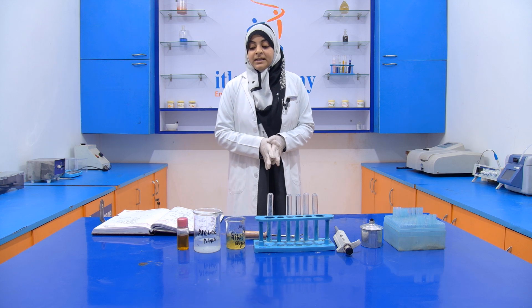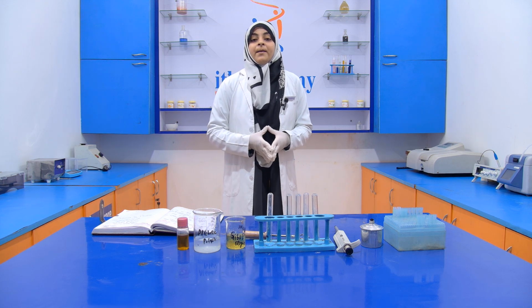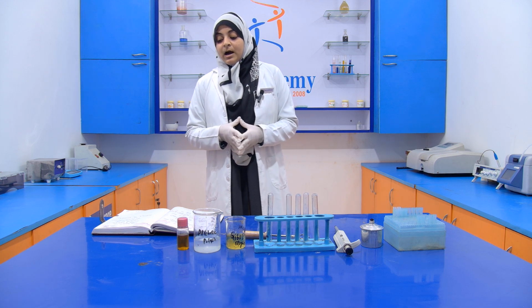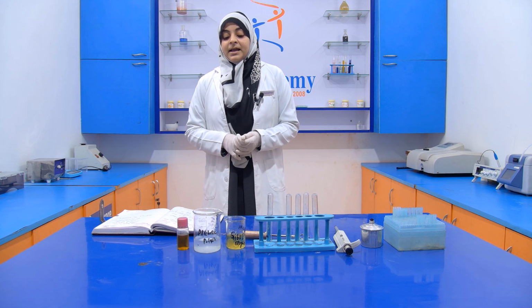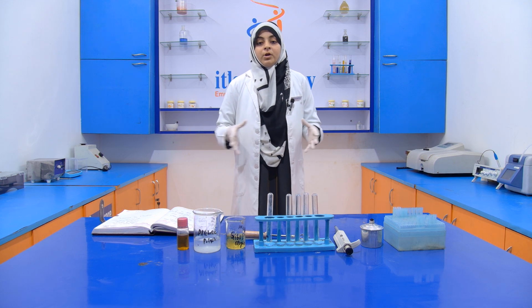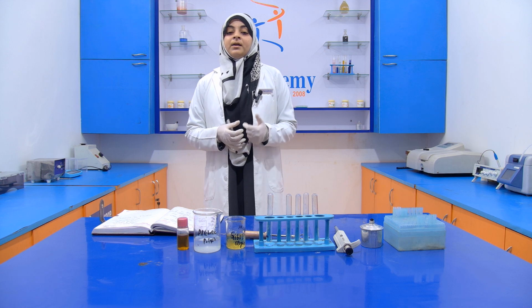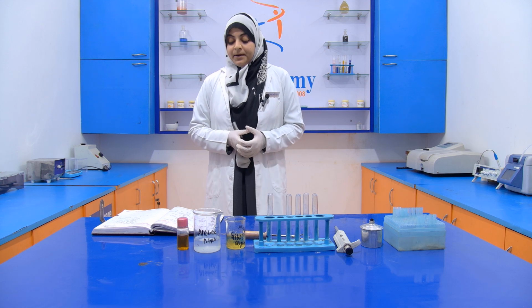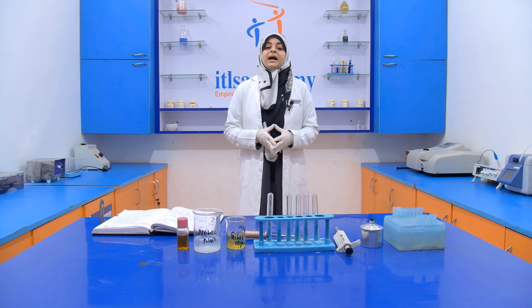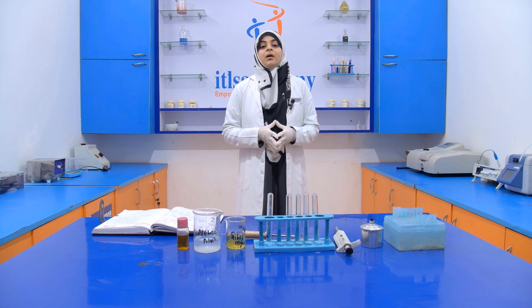Then we heat the tube on the burner. Then it is decolorized. After that we add 1 ml of this Gibbs reagent, that is dichloroquinone chloroimide solution. After that, we again warm the tube on the burner. Then if a blue color appears, it indicates that our sample is adulterated with mobile oil.